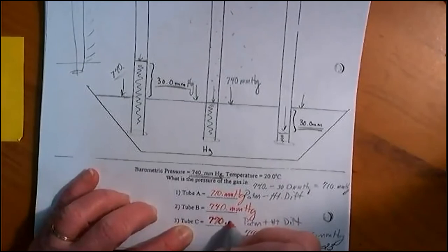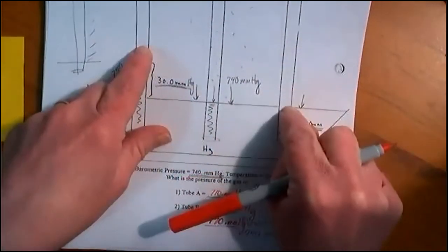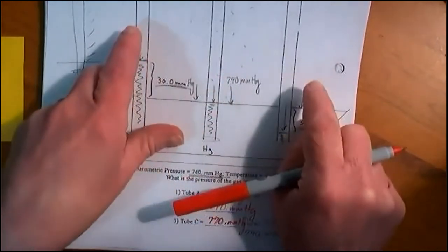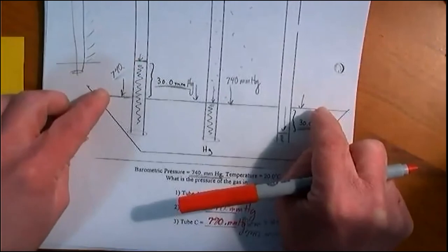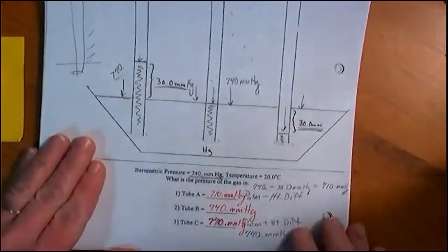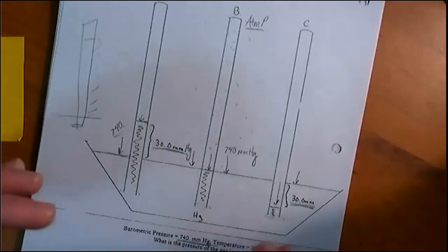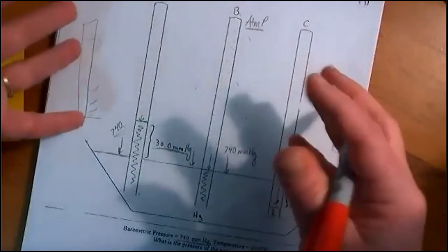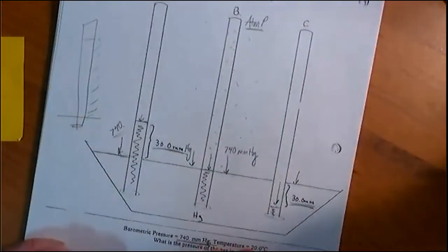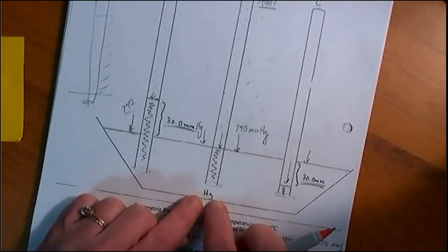So we are not putting a device inside to directly measure. We are measuring the pressure by a comparison to atmospheric pressure. So this lets us know what eudiometers do, how we use them, but we've just talked about mercury, and we know the toxicity of mercury.